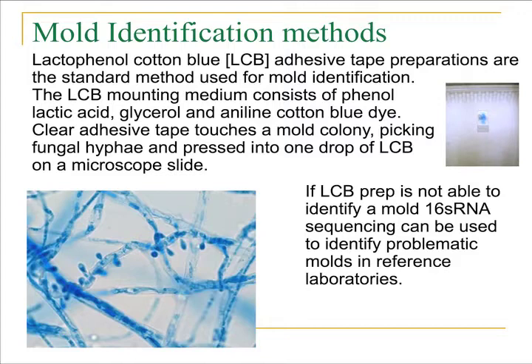The next step, of course, is to look under the microscope and visualize the type of hyphae that has been produced and if there's any conidia that has been produced. There is a picture of the lactophenol cotton blue prep on the slide, and you can see that it has kind of a lightish blue color background, and it helps stain the conidia and hyphae to make them more visible.